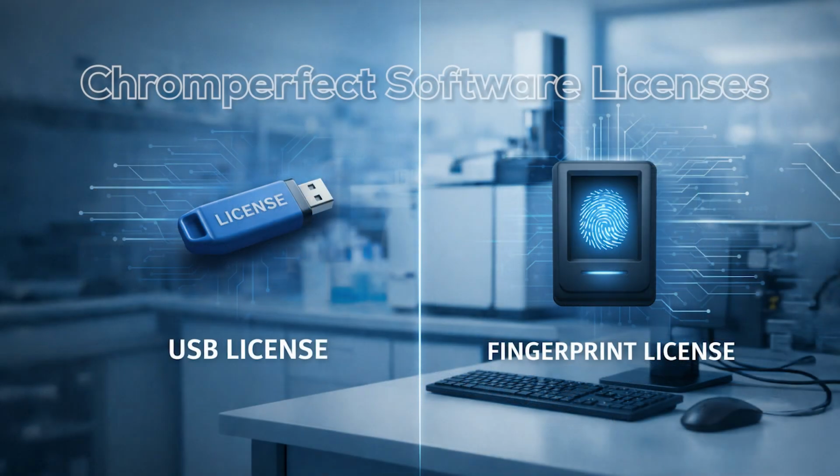A Chromperfect software license allows the software to be installed and used on a PC. There are two ways a license can be provided. The first is a USB license key. This license is portable and can be moved between computers, but it can only be used on one PC at a time. The second option is a fingerprint license. This license is locked to a single specific PC and cannot be moved. We have a separate video that explains these two license types in detail.